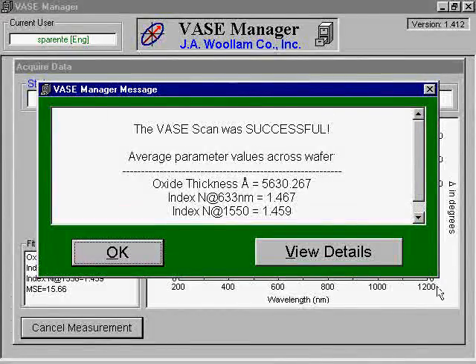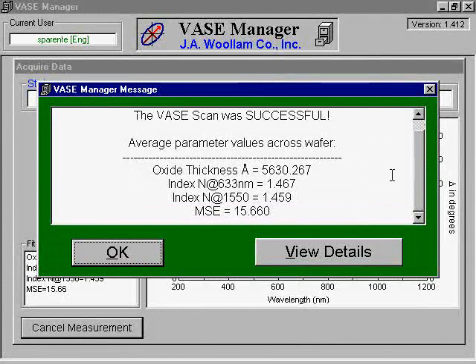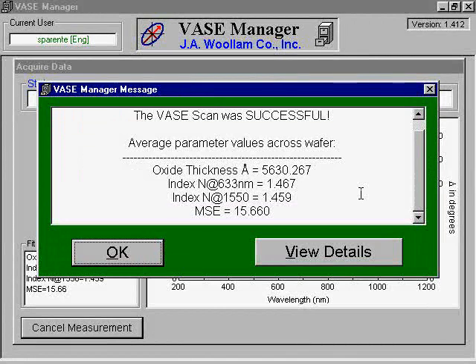The software should now have a summary of the results of the scan. The data provided includes film thickness, refractive index, and mean squared error, or MSE. The lower the MSE, the better your sample matches the model of the recipe selected prior to scan. An MSE value greater than 100 typically suggests the analysis method did not accurately model your sample, and you may wish to reanalyze your sample.